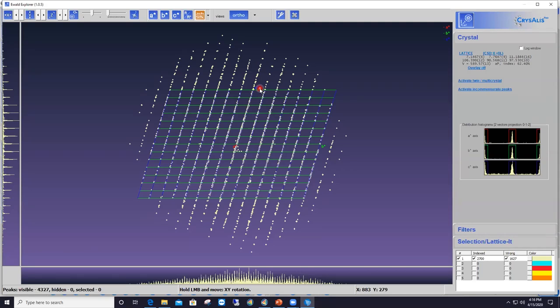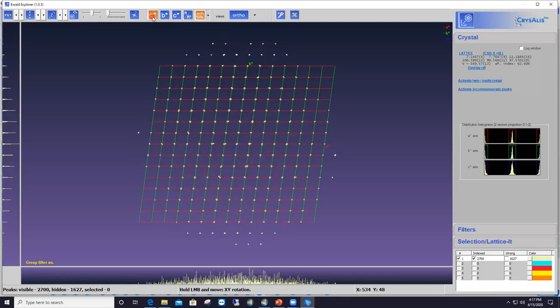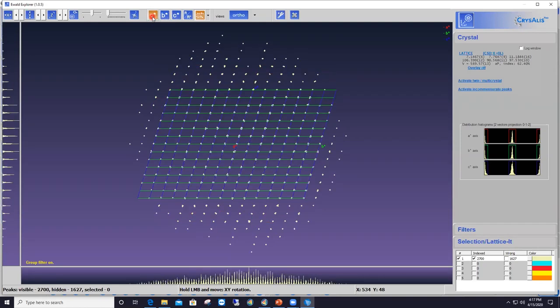Was our indexing wrong? To check, let's look only at the indexed reflections. The table shows 2,700 reflections indexed and 1,600 unindexed. Turning off display of unindexed reflections, I can see that all indexed reflections coincide perfectly with lattice points along A-star, B-star, and C-star — strongly suggesting our indexing was correct. The problem is that when we bring back the unindexed reflections, about 38% are not accounted for — we have multiple diffraction patterns.